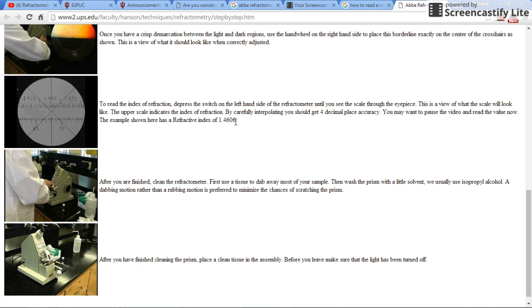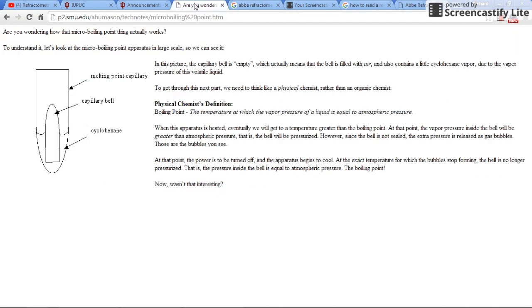Now the third thing is going to be the boiling point, and we're going to do the boiling point in the melting point machine. You know what our little capillary tubes look like. It's unbelievable, but we can take that capillary tube, and I have capillary tubes that are even smaller than that. We're going to turn those upside down. So what you're going to do is put liquid into the capillary tube, and you'll drop this smaller capillary tube in there upside down.